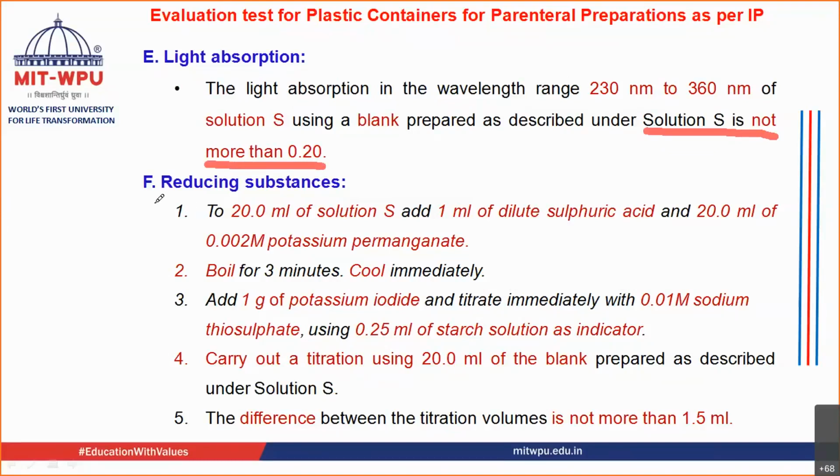The next test that you carry out is about the reducing substances. Now, please remember, all these tests are already given in the IP.